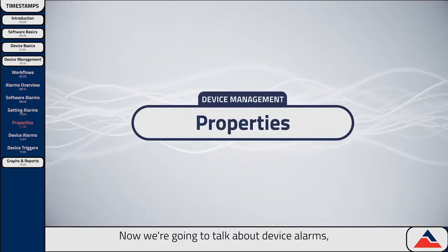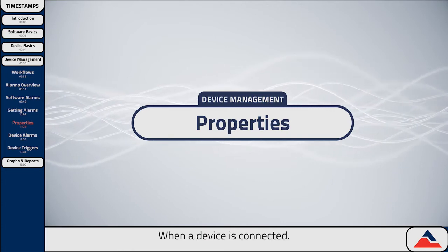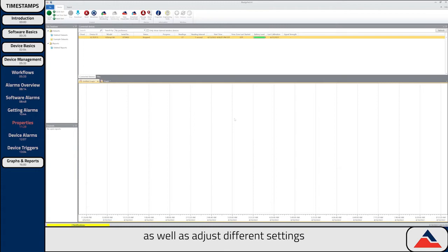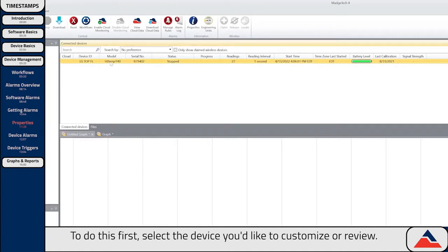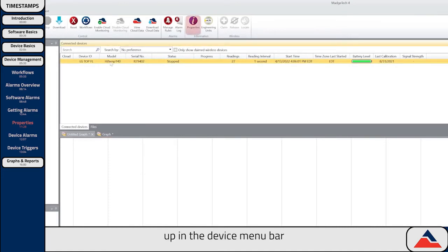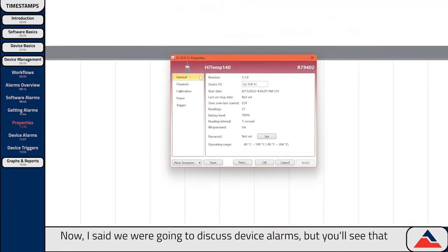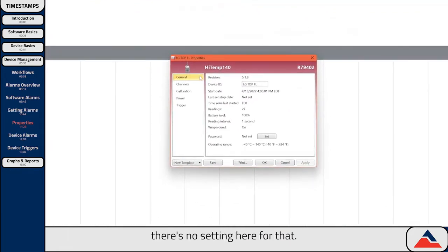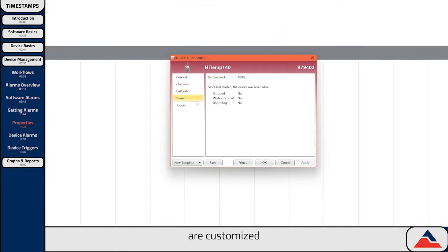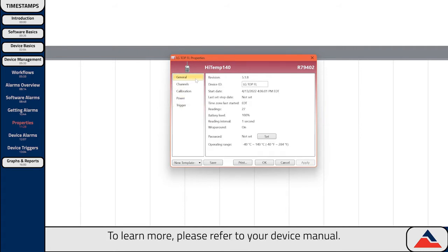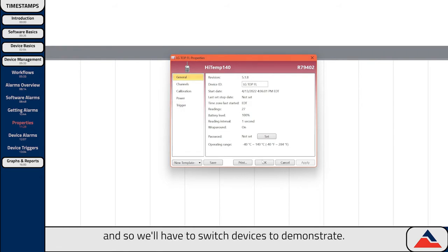Now we're going to talk about device alarms, but first we need to discuss properties. When a device is connected, you can review all information about a connected device as well as adjust different settings to customize its functionality. To do this, first select the device you'd like to customize or review. Then either select Properties up in the device menu bar, or right-click on the device and select Properties. The properties menu for all devices is customized to only show features that are compatible with the device. The HiTemp 140 doesn't feature device alarms, so we'll have to switch devices to demonstrate.